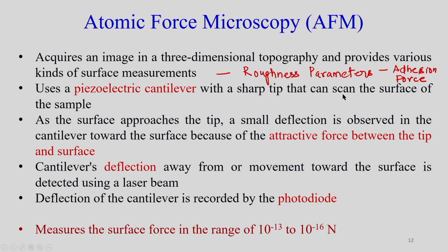Now, during the scanning of the surface, we can scan a surface either in contact mode or in non-contact mode. Sometimes it is also called the tapping mode. So, as the tip approaches the surface, or the surface approaches the tip, basically the surface is fixed, and the tip approaches the surface.